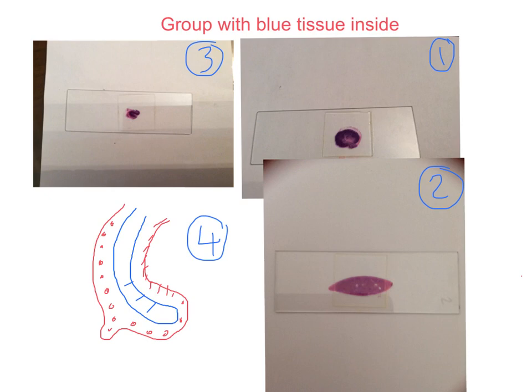The second slide is almost always spindle in shape, but it is characterized by having the blue dots scattered uniformly on the surface, not only at the cortex, while in the lymph node these blue dots, circles or follicles are present at the top only.